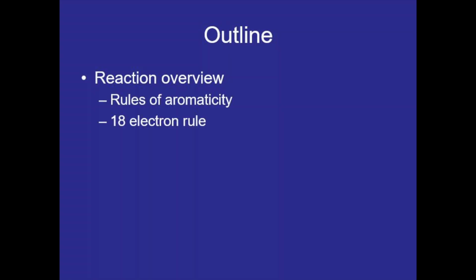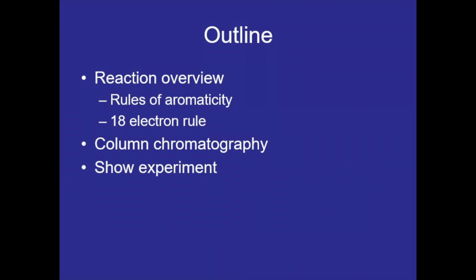So I'll talk about the rules of aromaticity and go over the 18 electron rule for transition metals. Then I'll be talking about column chromatography for a little bit, and I'll show the actual experiment in the lab.